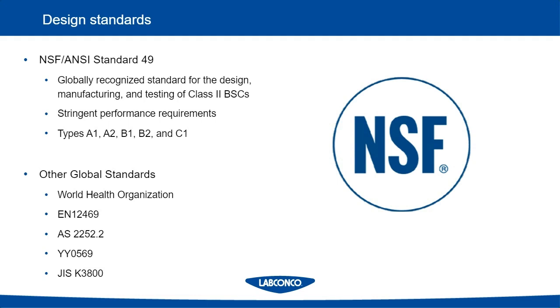There are very stringent performance requirements that all manufacturers must meet to have an NSF listed biosafety cabinet. And these include vibration tests, lighting tests, material construction tests. They include, most importantly, the biological challenges. So all cabinets go through a biological challenge with actual bacteria to make sure that they contain and do what they're supposed to do when delivered.